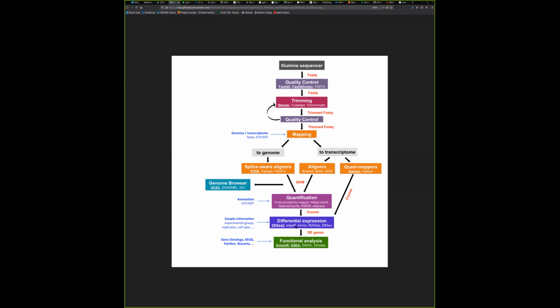So these are different ways for you to do this. I just realized that you have IGV here. So yes, you can use IGV or UCSC to visualize the BAM files, and then make a decision on the quality and further quantification.